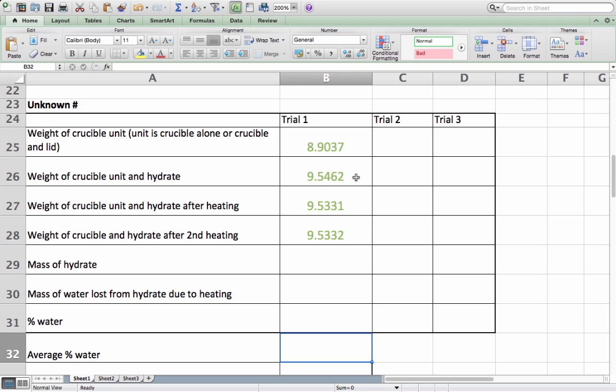Next is the mass of my crucible and hydrate after the first heating, and then after the second heating. You will see that there is just a small difference in the last decimal place. And so I can conclude that I have achieved constant weight. To calculate the mass of my hydrate, I would simply subtract the mass of the crucible from the mass of the crucible and the hydrate. So, mass of the crucible and the hydrate minus mass of the crucible. My hydrate weighs 0.6425 grams.